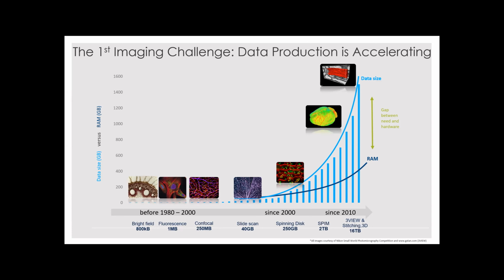And this is not only an increase in XYZ dimensions, but also in time and channels. And the issue which arose from this acceleration in data production is that the hardware has not been able to catch up, resulting in a gap between the need and the hardware available for processing. So that's one issue of this challenge.